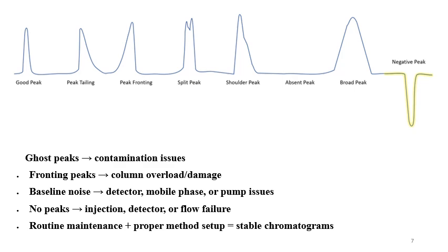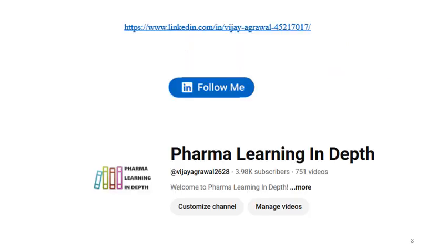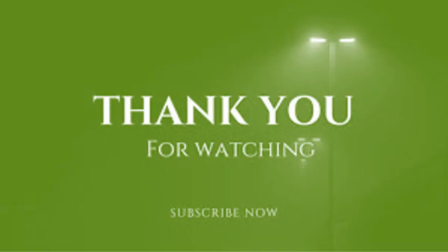Now we will quickly go through the problems which we have understood. Ghost peak means contamination issues, fronting peaks mean column overload or damage. Baseline noise is because of detector, mobile phase or pump issues. No peak means injection, detector or flow failure, and routine maintenance and proper method setup can give you stable chromatograms. So this is regarding the problems associated with HPLC. These are common problems and how to solve them.